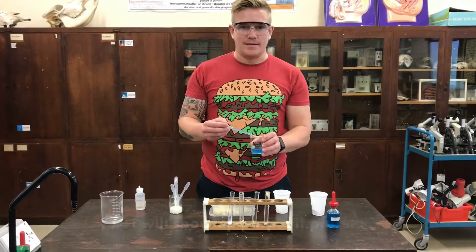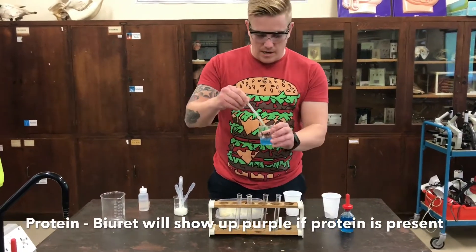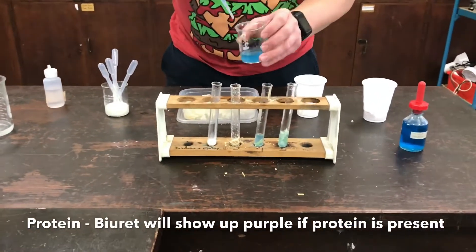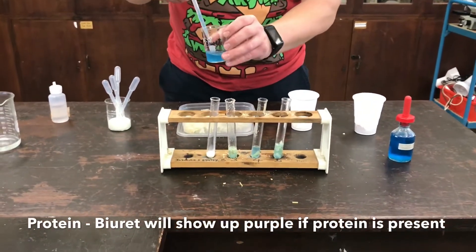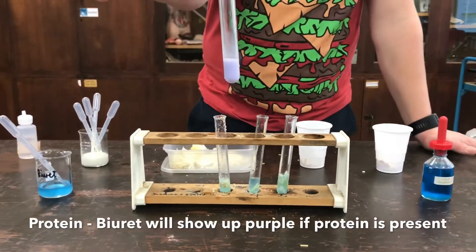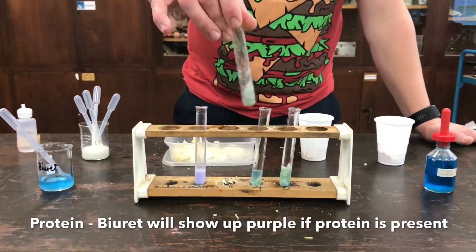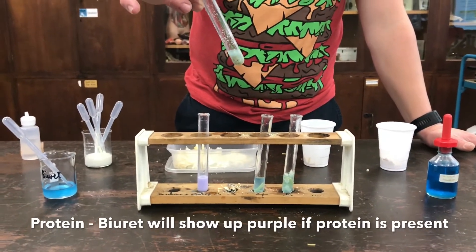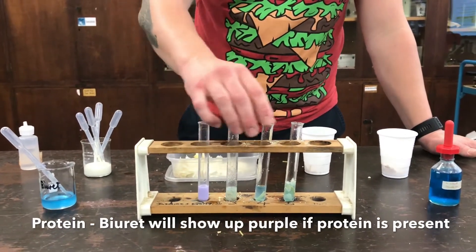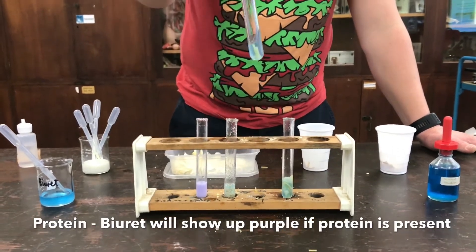Next on my test selection will be biuret. I'm going to test for protein with biuret. Get that in there, give it a little shake, and have a look for some protein in my food samples. As we know, biuret will go purple instantly — we can see the milk has changed to purple. The biscuit is not really giving us much purple, just a tiny faint amount. Same with the crisp — a tiny faint amount of protein — and very little in the pasta.